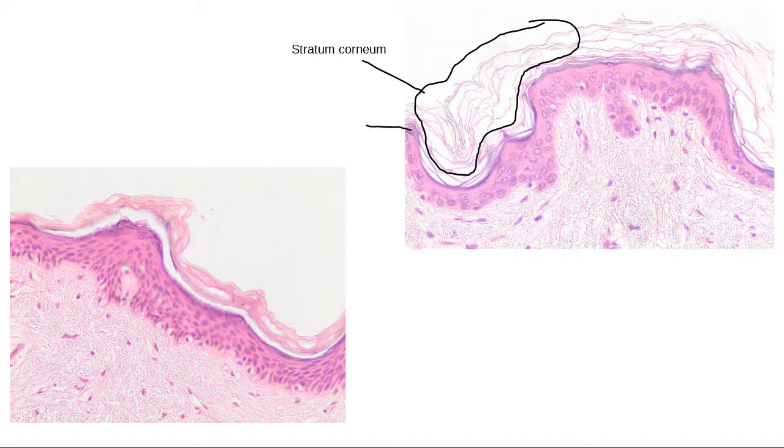Next, I can see the purple layer. I love how clearly you can see that purple, right? I'm going to draw a line around a lot of it. So that purple, these were the cells that were filled with granules. These were the ones we called stratum granulosum because they're filled with those purple granules. Technically, stratum spinosum would be right underneath that.